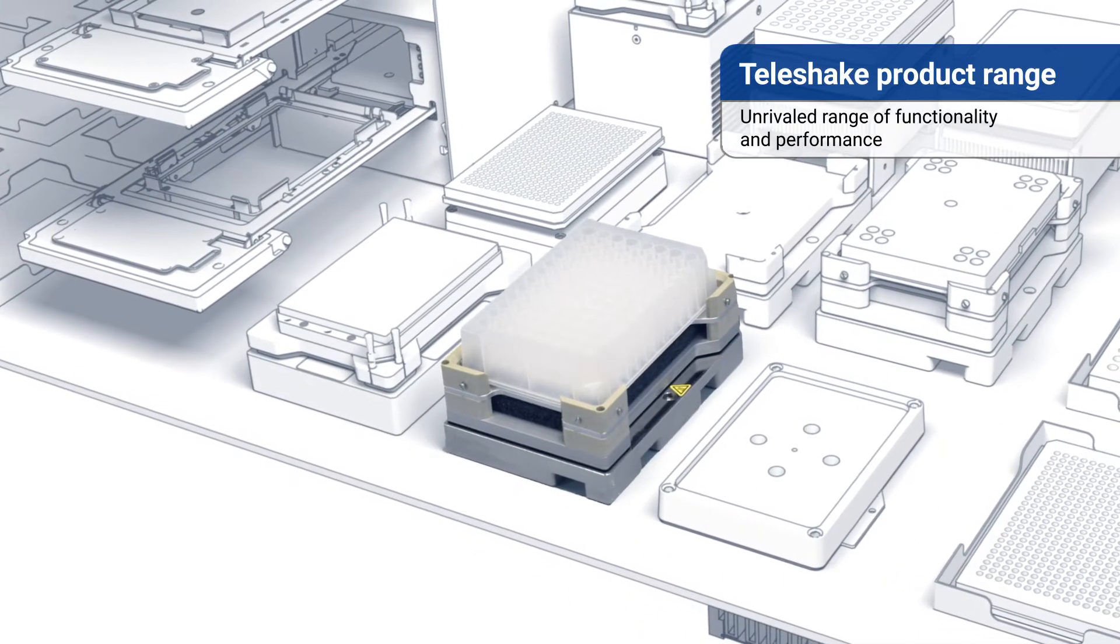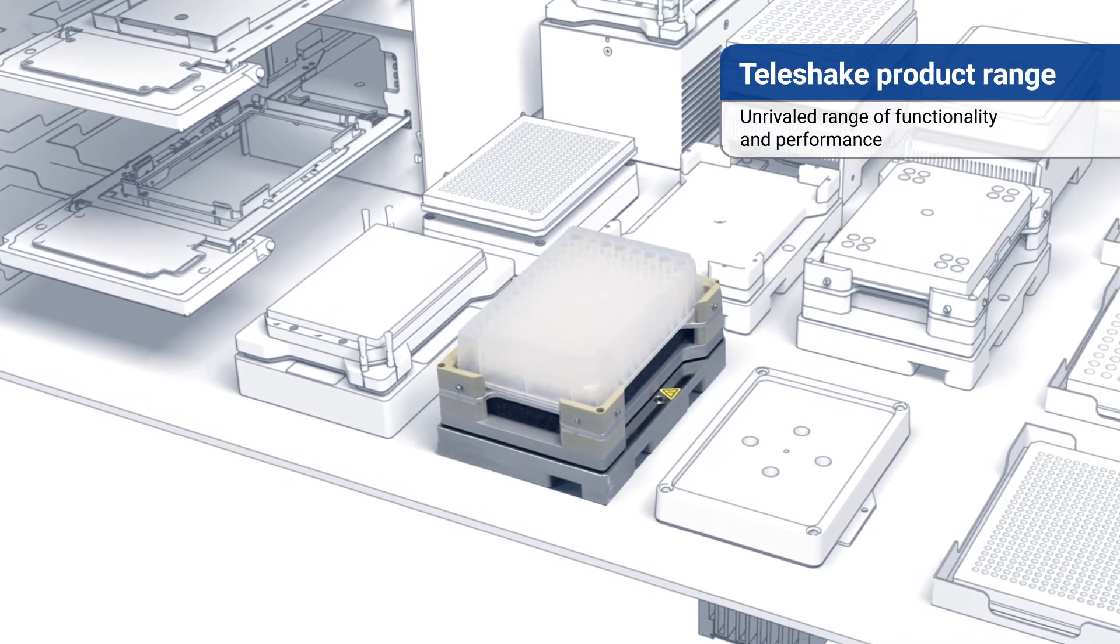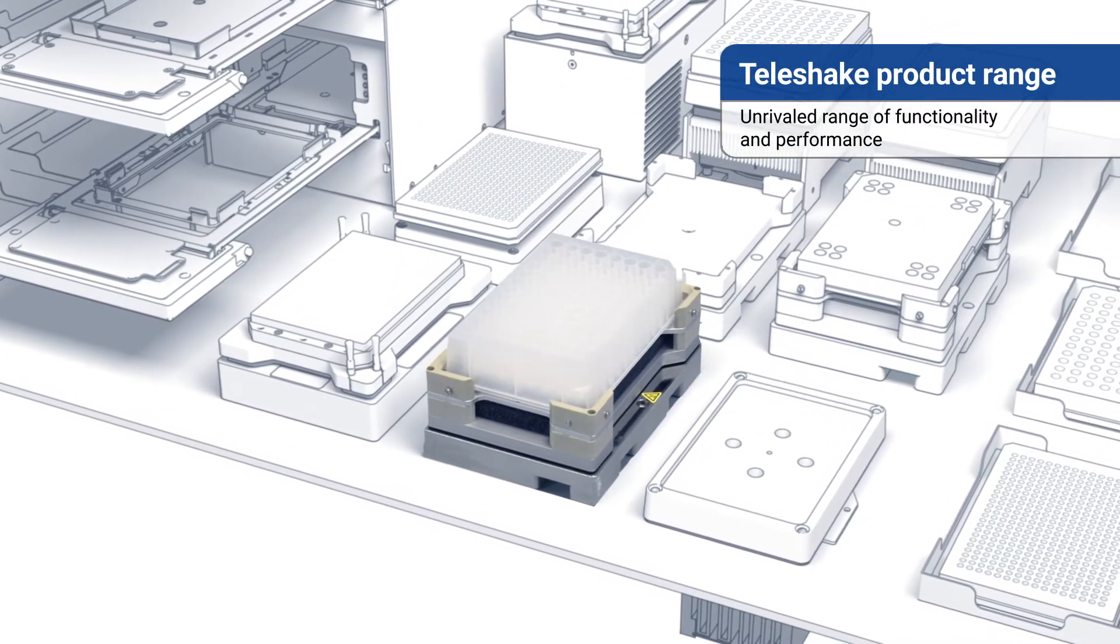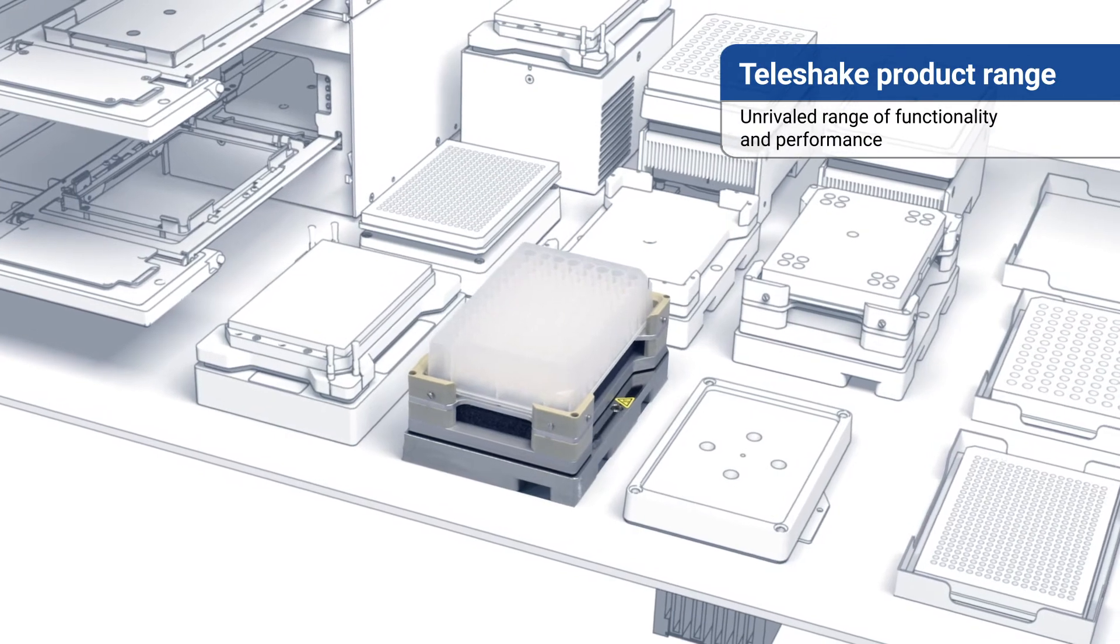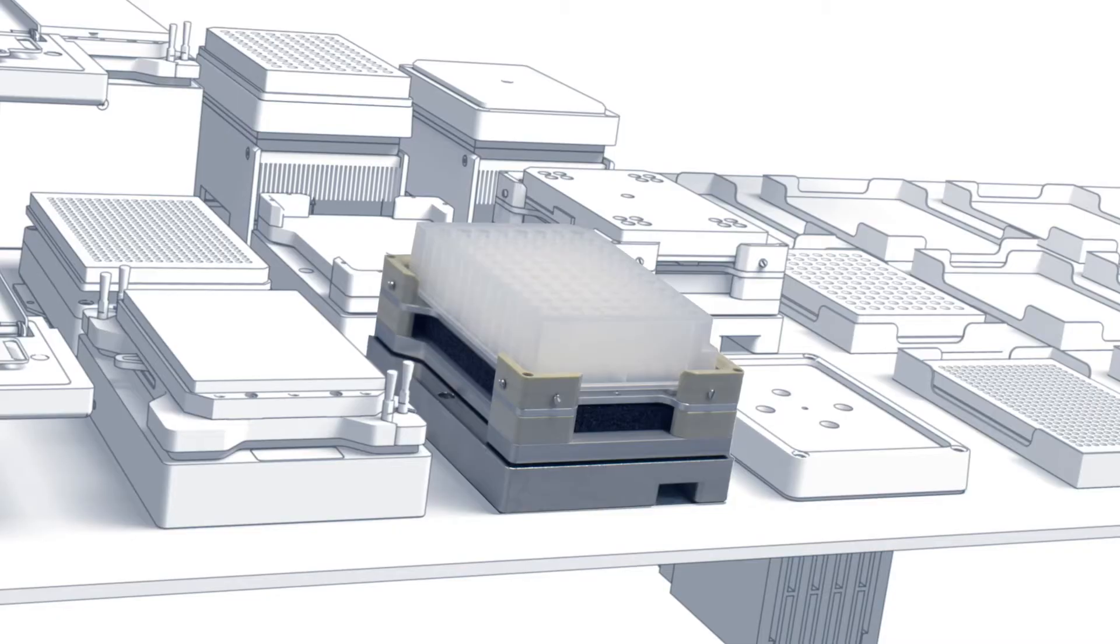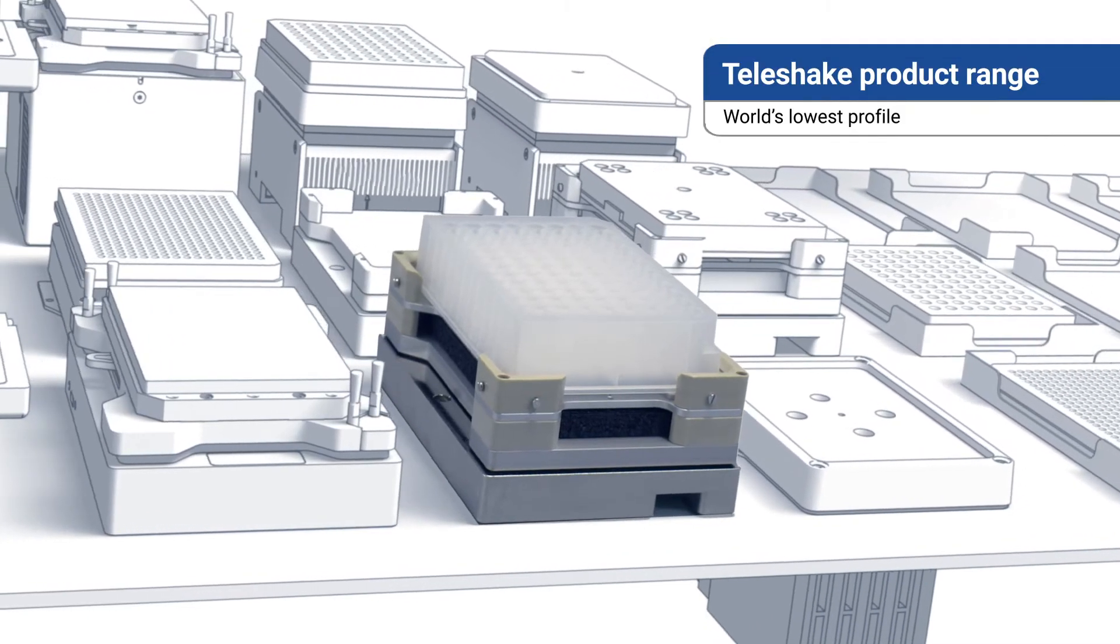Inheko shakers deliver an unrivalled range of functionality and performance, requiring only one ANSI SLAS plate position on deck, occupying little more space than a standard microplate.